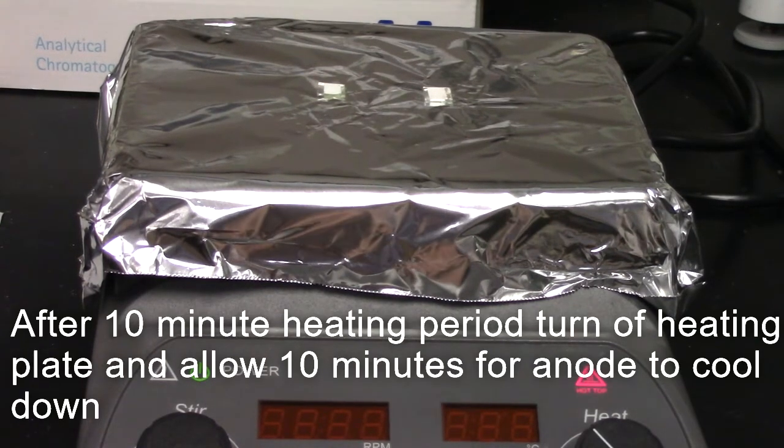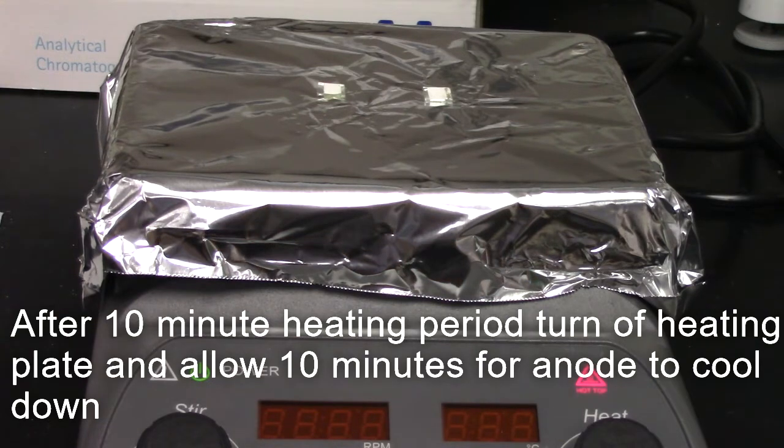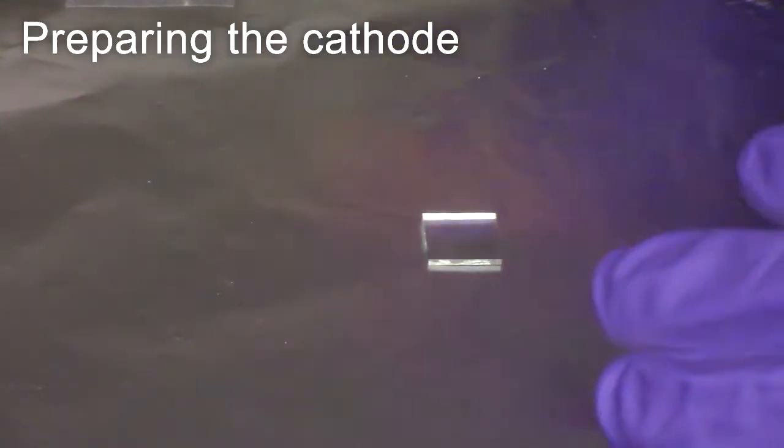After heating for 10 minutes at 50 degrees centigrade, turn off the heating plate and allow the anodes to cool for 10 minutes before removing.